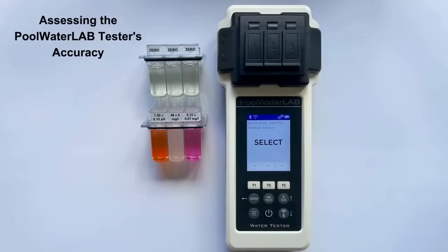In this video, we will demonstrate the accuracy of the Pool Water Lab Tester and explain how to correctly verify the accuracy of any water parameter measuring device.